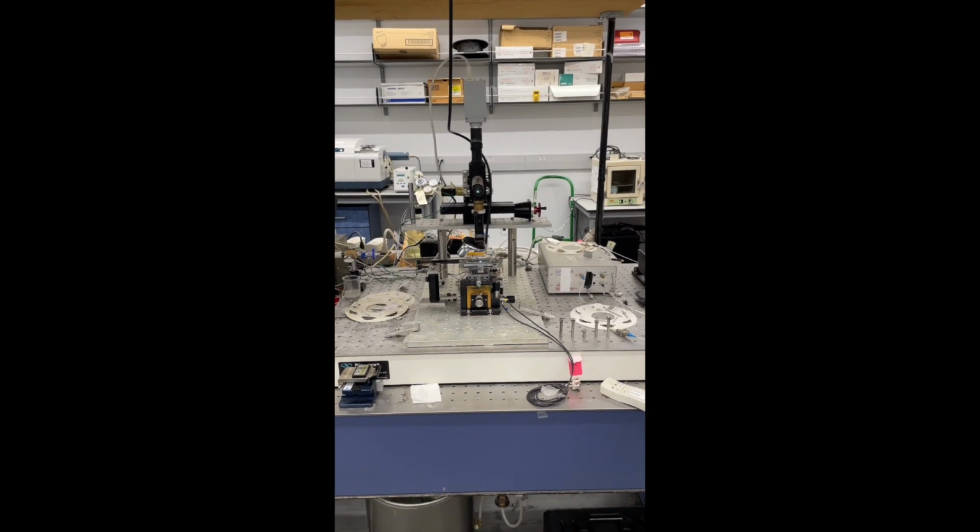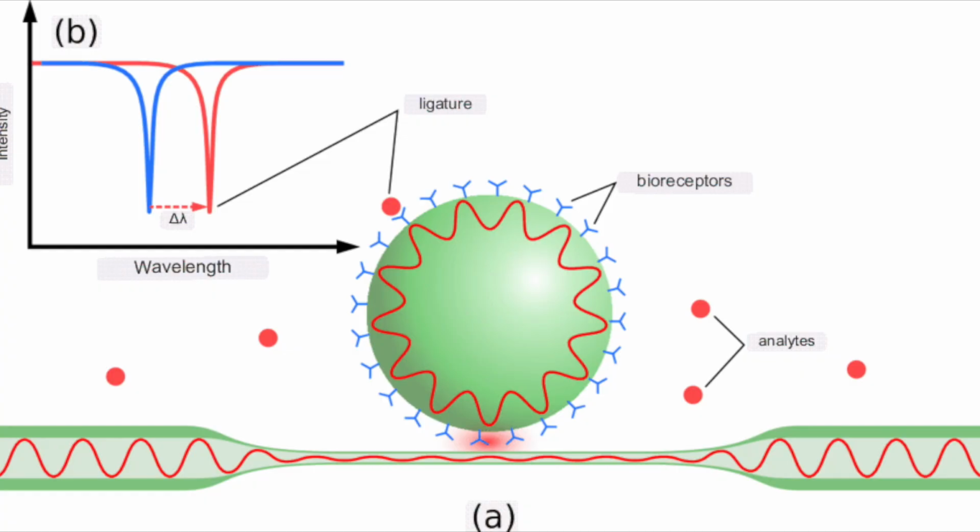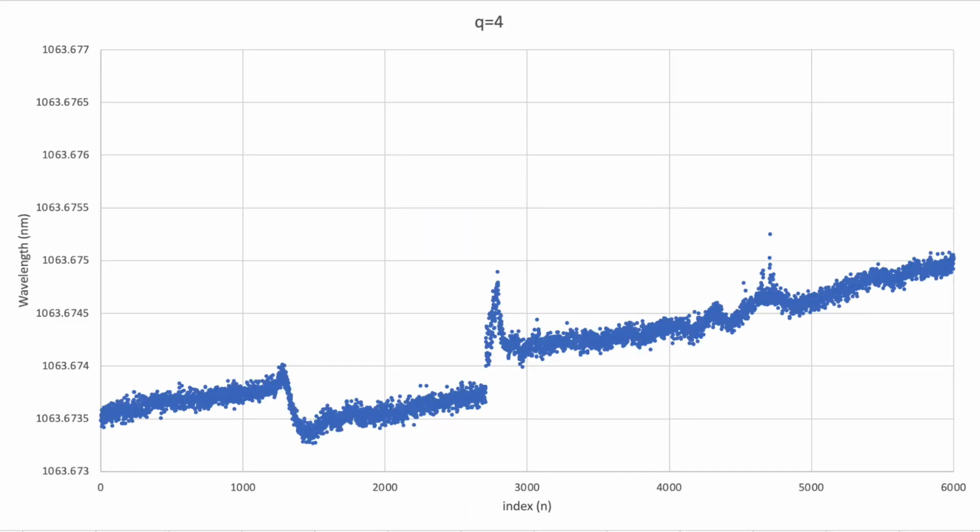This is when we bring up our other machine, the WGM. The WGM can have a protein of interest attached to it, and we can pass small molecules through looking for a match to bind. If there is a match, the WGM shows a new signal, and we note that the molecule could be a new medicine to use.